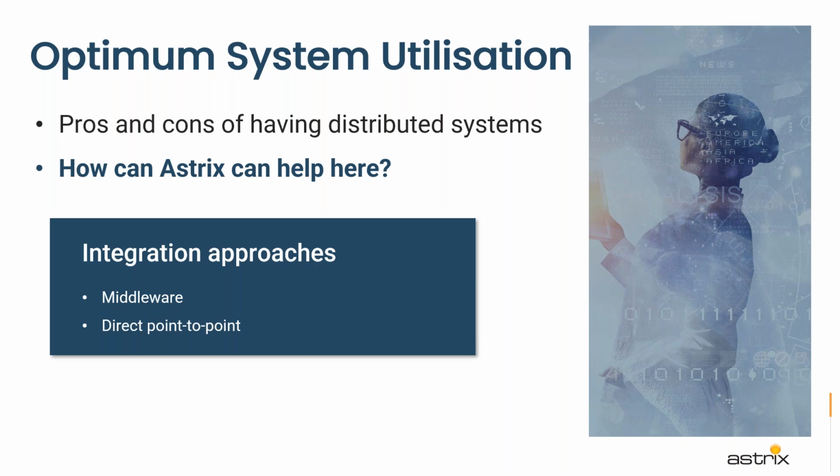So a balance, and I use that as an example of what I would call a dumb instrument. And I know the Sartorius Cubis balances are a little bit more high tech, but your simple balance will have a completely different integration mechanism than a chromatography instrument that requires a more sophisticated method of integrating into your workflow. For that, you have the hardware, you have the instrument control software running on that hardware. You also have the software running on the PC that's basically sat next to that instrument. But for a balance, you're probably linking to an RS-232 port. You highlight a cell, you press the print key, and the weight gets pasted into whatever cell you're highlighting in your LIMS or ELN or other technology.